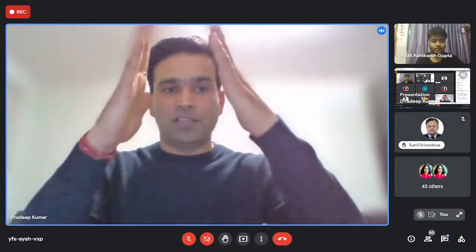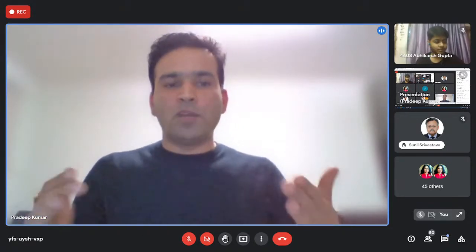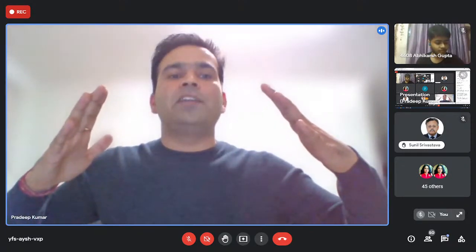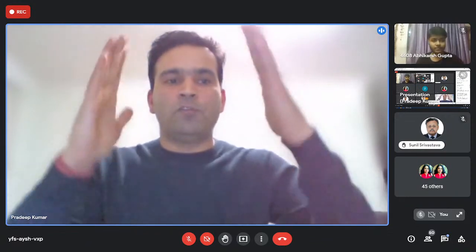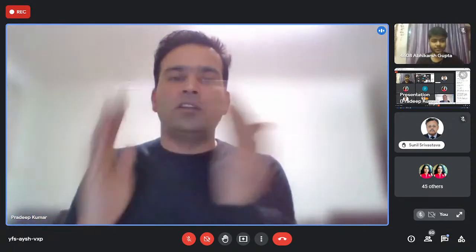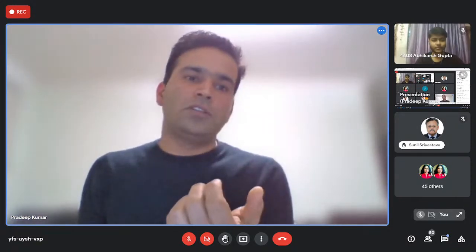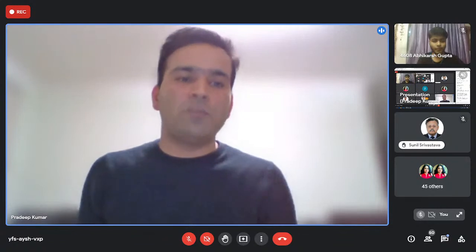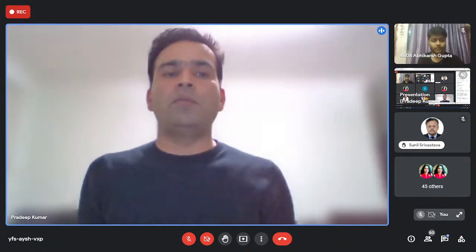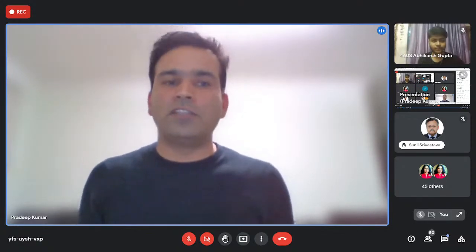The design of the flow cell is like a conical flask. If you throw a long wooden block in a river, the moment the river bank comes, the wooden block automatically aligns to the flow of water, and that's how it's flowing parallelly. So the outer covering is the sheath fluid, and the inner is the sample. It's achieved by maintaining the laminar flow, by adjusting the pressure of the system. They never mix with each other.